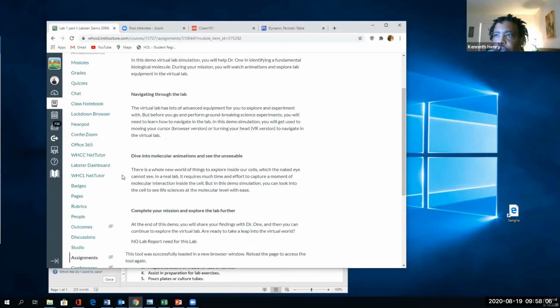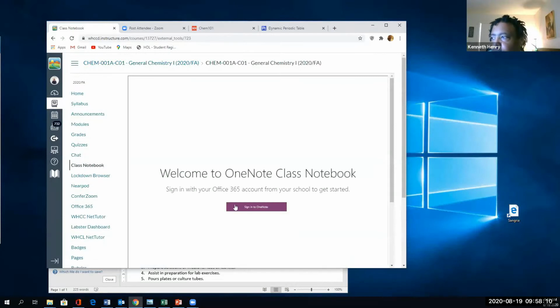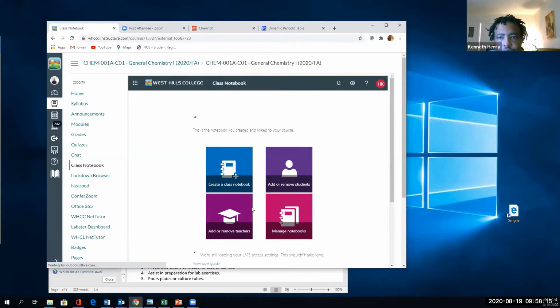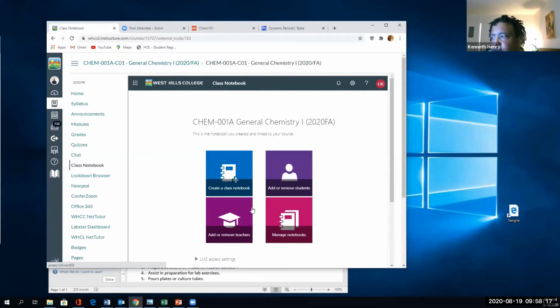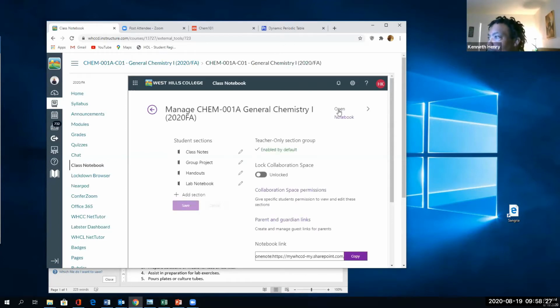Okay, so what you're going to do is go to Class Notebook. You're going to sign in. You're going to use your campus email and password. And then it should just take you directly to your lab notebook. Give me a second to get to where we should be.